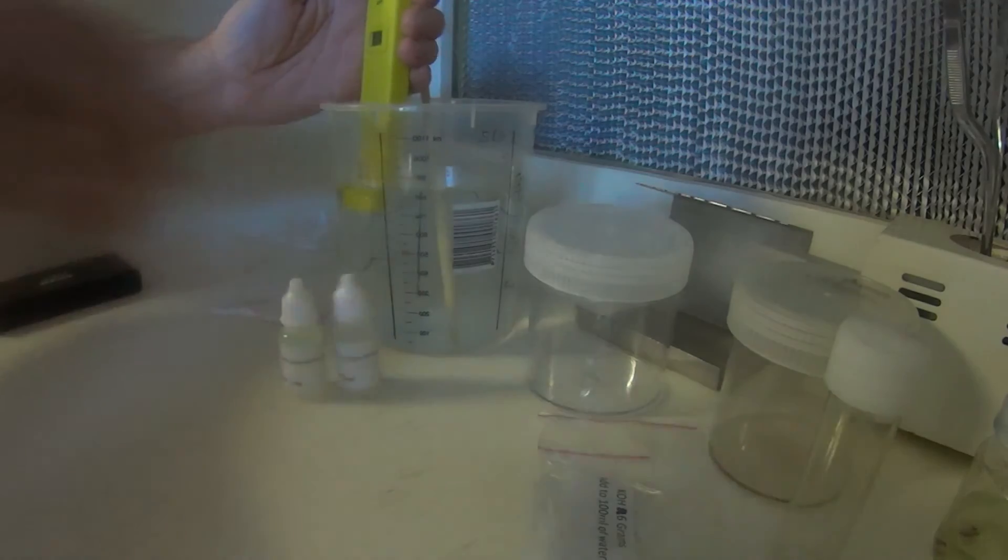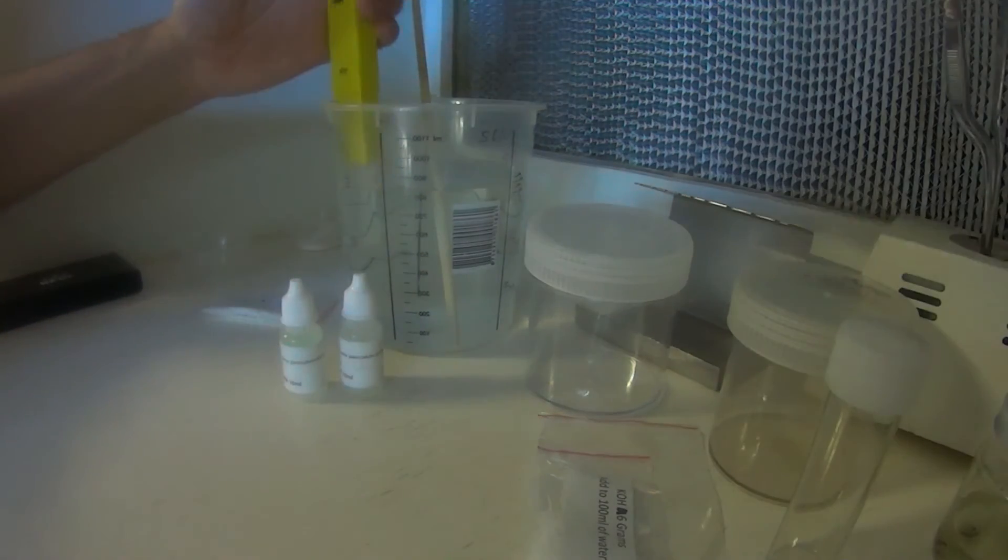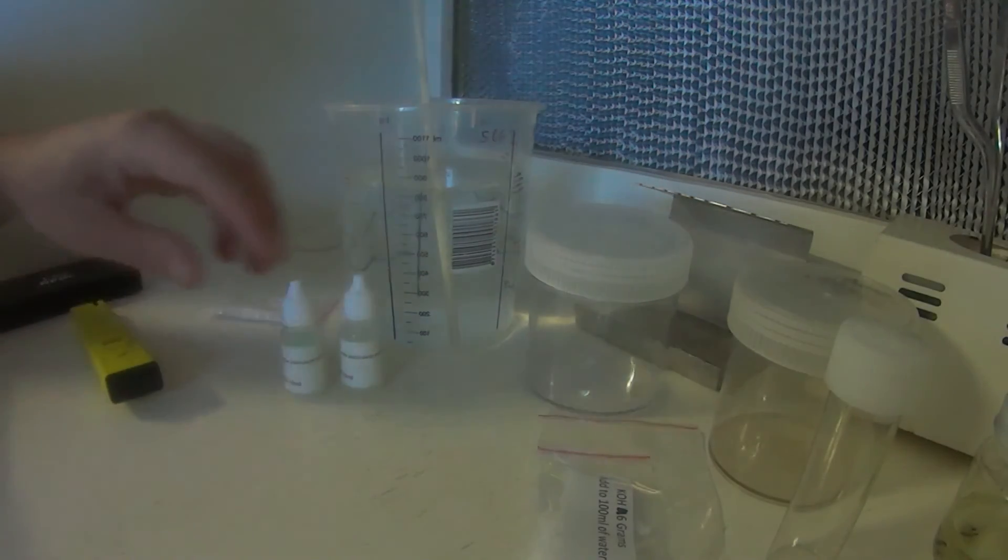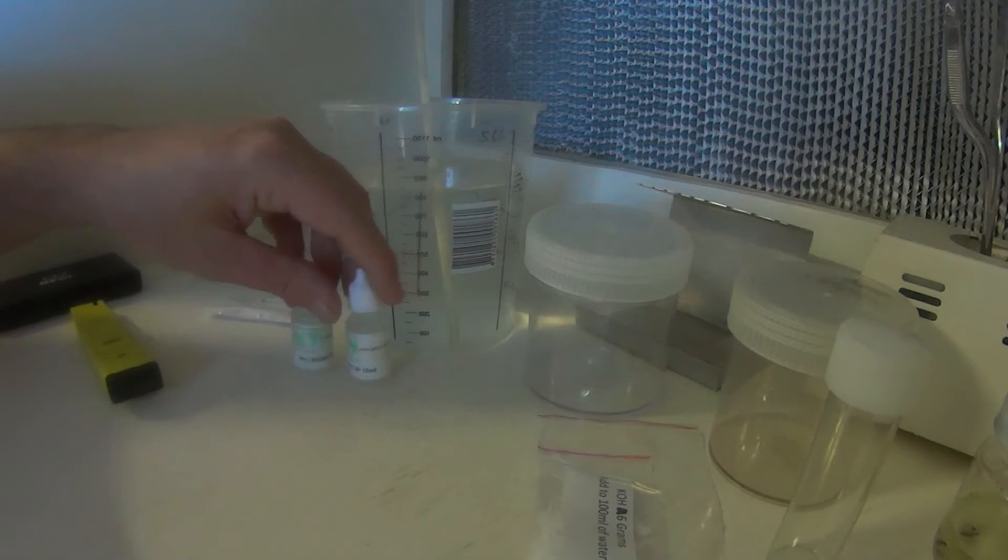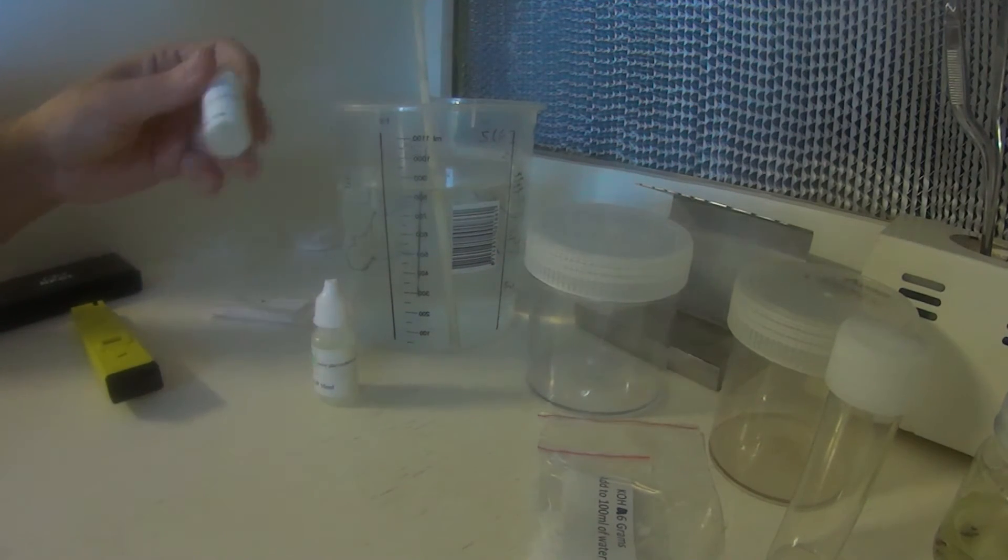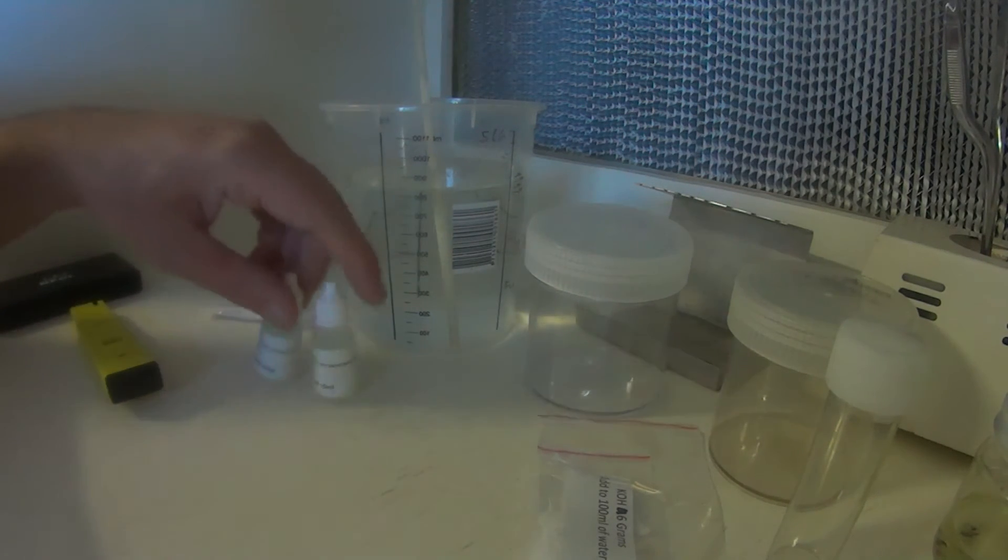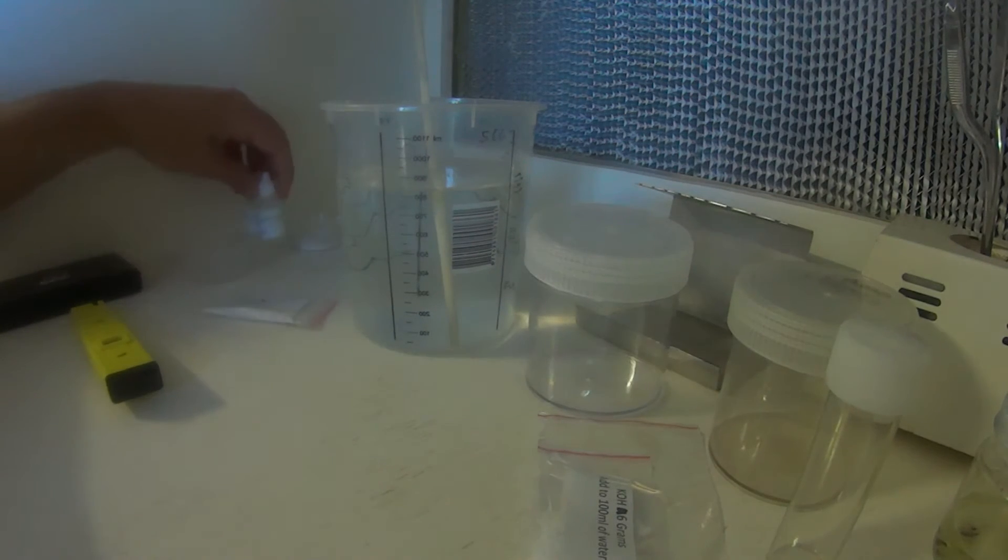Also in the kit, we have our pH adjustment solutions, pH up and pH down, a little 10ml bottle of each. This stuff goes a long way. I've had these bottles, I've been using them for about six months now and they're still half full.